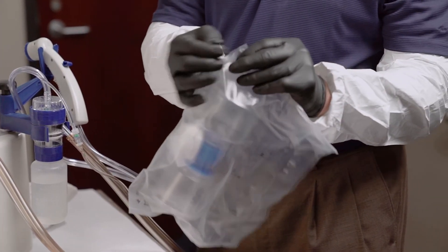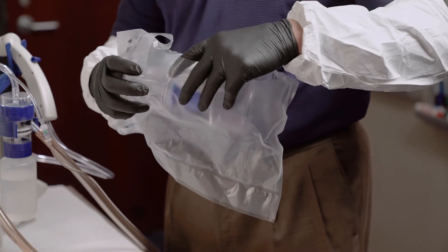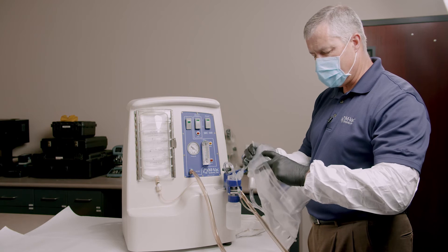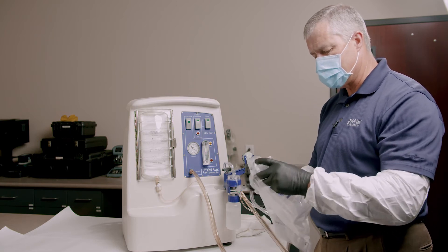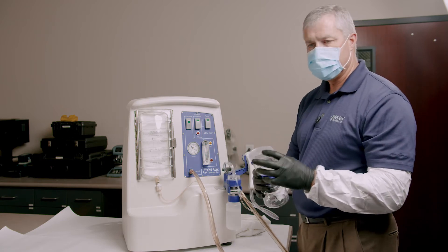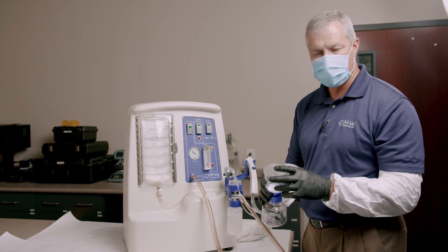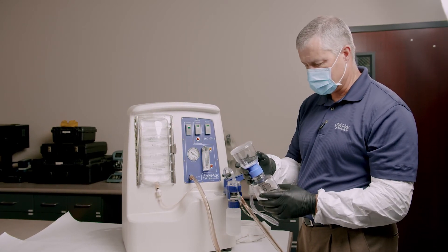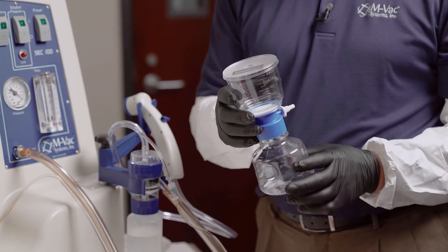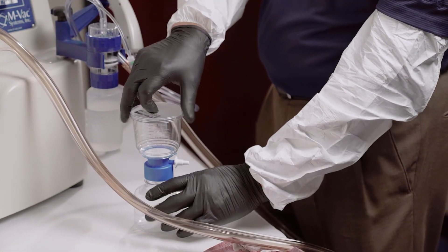Again, it's a 0.45 micron filter. There is an exact same format at 0.20, but we found that since most cellular material is larger than 0.45 microns, recoveries have always been really good even with the 0.45 micron filter. This is just an off-the-shelf item that we found works really, really well.